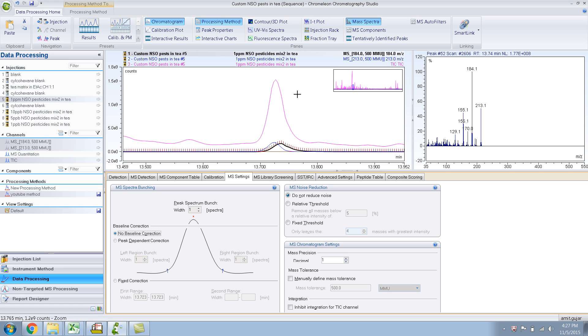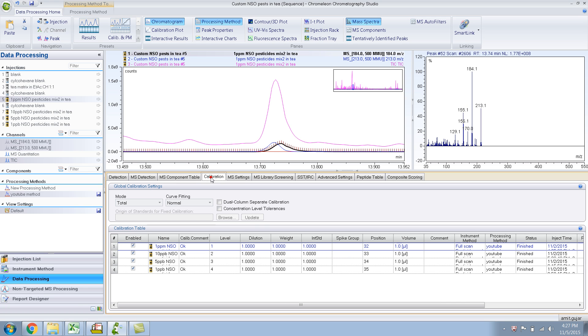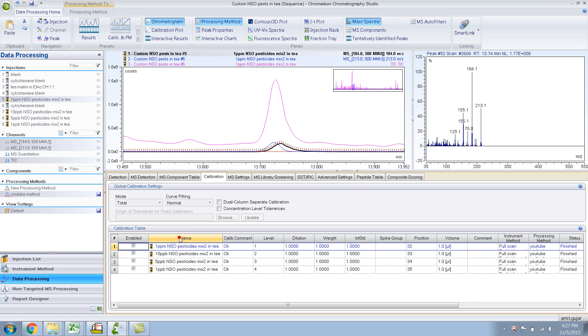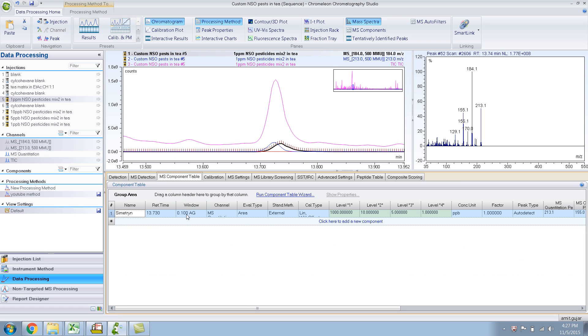Now, Calibration. This is another tab which basically shows you the calibration, general calibration information, which you already entered in your MS component table, right? Over here: thousand, ten, five, one.